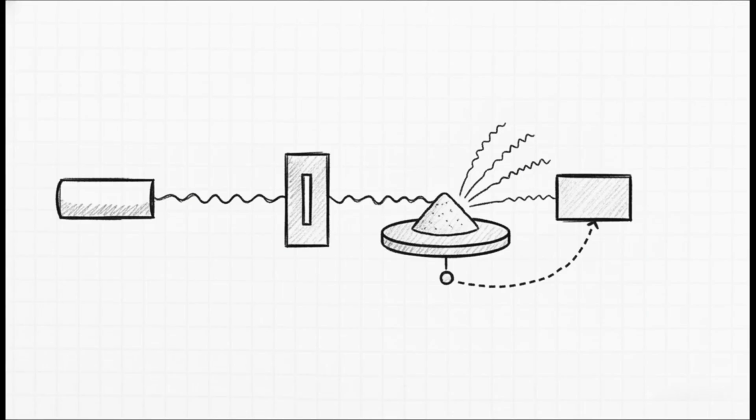All right, once prepped, the sample goes into the instrument. Let's track the journey of the beam. It originates at the X-ray source, usually a copper K alpha tube, and passes through a divergence slit to really focus it. This beam then strikes our sample, which sits on a rotating platform called a goniometer. As that goniometer spins, the detector moves along an arc, picking up the diffracted X-rays at various 2θ angles. It requires some incredibly precise synchronization between the source, the spinning sample, and the detector to pull this off.